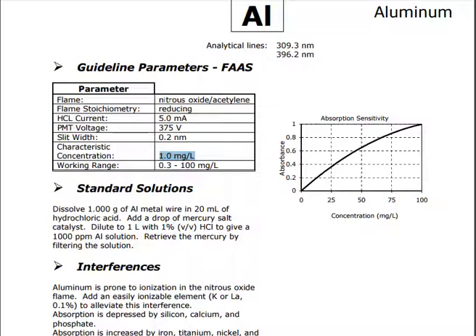Over here to the side, you will basically see linearity. So if we look at very low concentrations, it looks pretty straight up to a certain point, right? But after a certain point, it begins to curve and it will begin to deviate from a linear line.